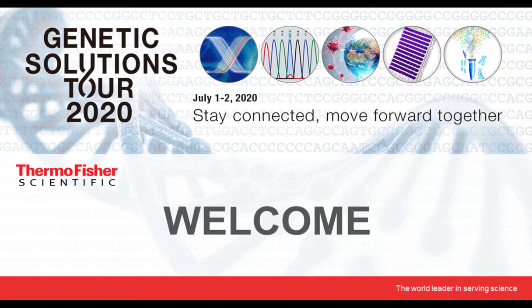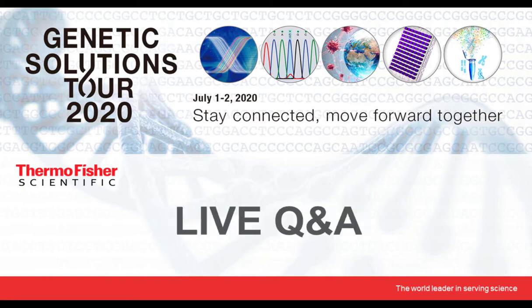The second question for Harita is, can the normalization be itself the source of error in some cases? And how do you decide what kind of normalization to use? Yes, normalization is actually a very key component of how the RT-qPCR experiments can be analyzed, and the choice of normalization can skew the data any which way. So it is very important to choose the right methods for normalization.